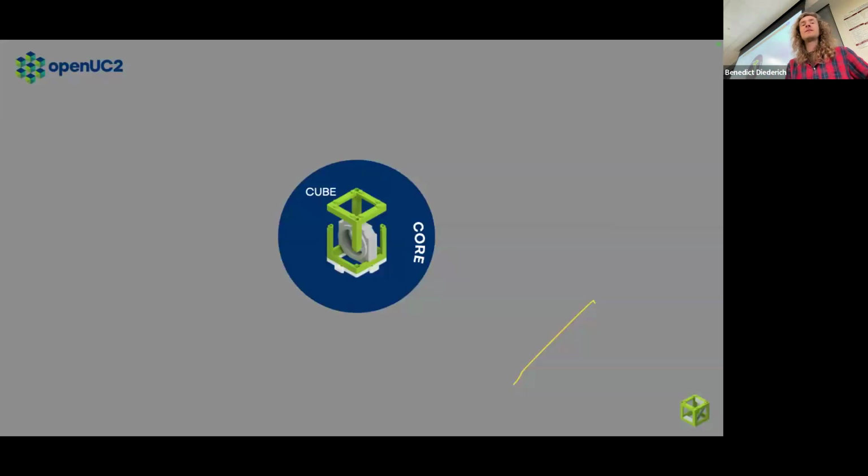And the way we do it, as I said, everything is open source. You can go online. The cube is basically just something that holds something. What you see here, for example, is a Raspberry Pi Zero that we use for hologram reconstruction for schools. It is held by an element that fits inside the cube. You can close it, and the cube is then put on the grid. The grid holds cubes in all directions, so you can put them here, and you can also extend it into a third dimension. That's the idea.